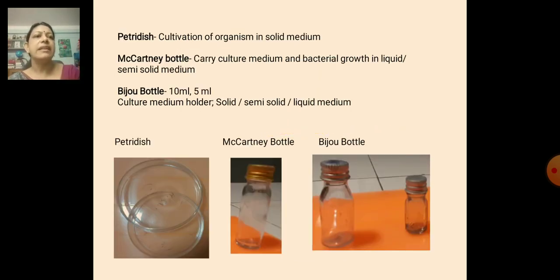Now, the next slide, the Petri dish. What are Petri dishes? These are glass plates, as you see here. It has two parts, the lower dish and the covering upper dish. What is done is a solid agar plate, that is a solid medium. In the test tube we can use a liquid medium, but in the plate a liquid medium can never be used because it will fall.